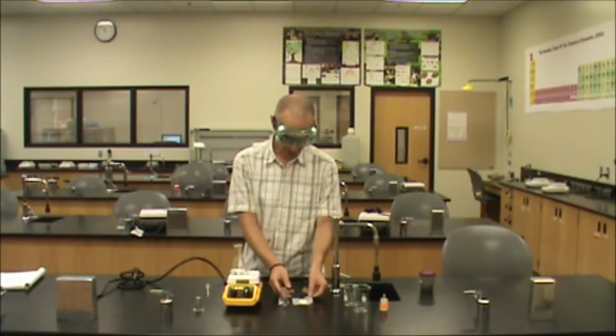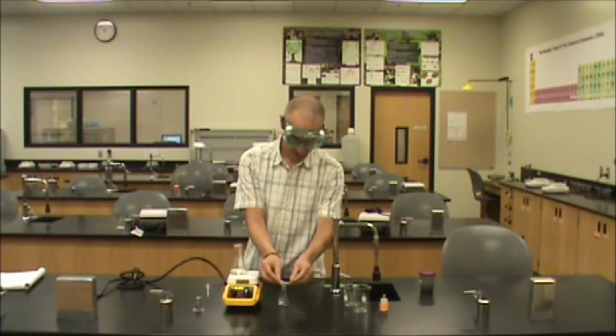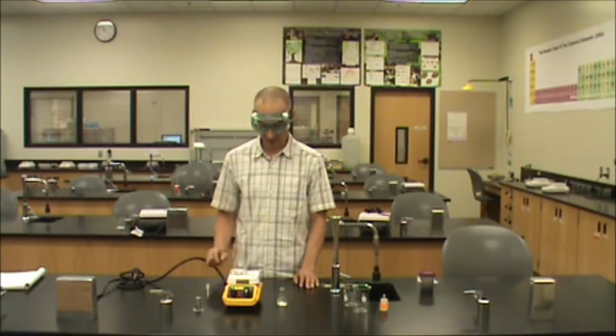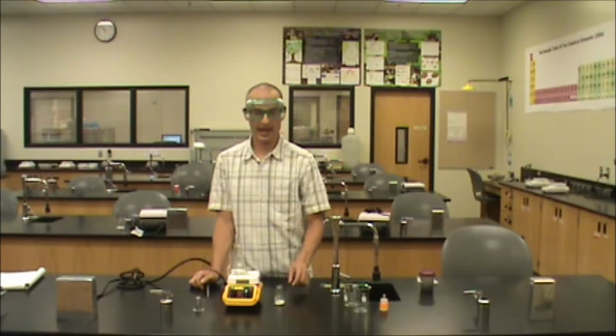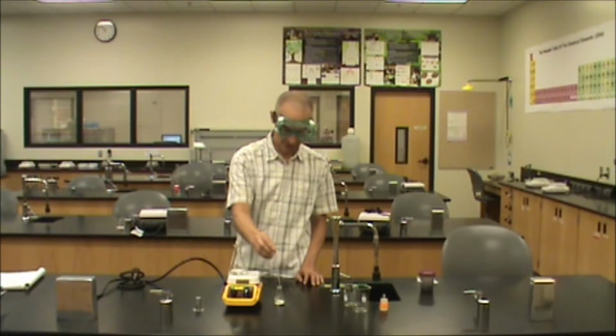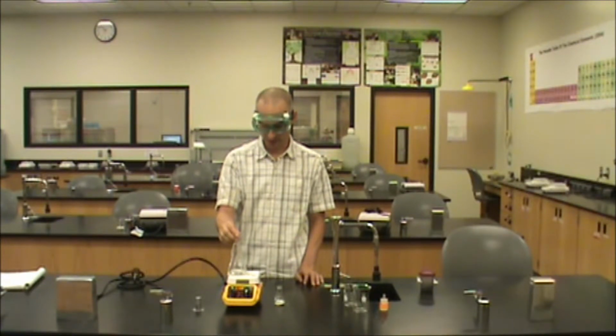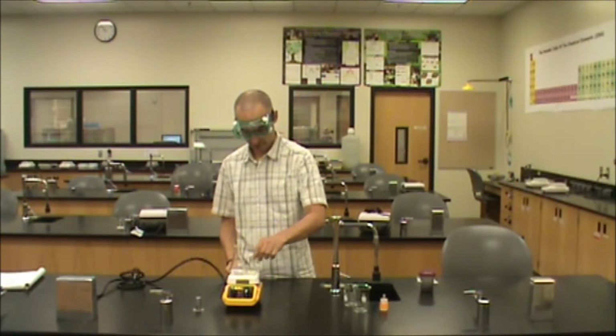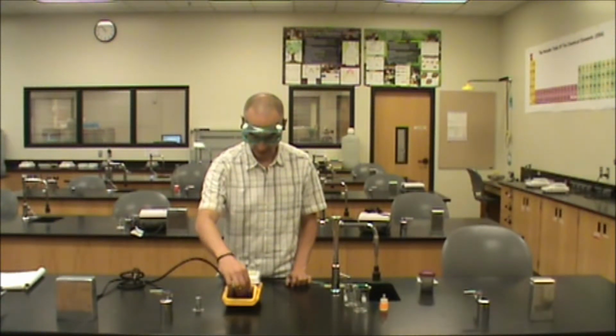I'm going to pour our impure material into a 25 milliliter Erlenmeyer flask. To this flask, I already added a stir bar. The stir bar is going to agitate our solution, as well as provide a surface on which bubbles can form. It's very important that before we add this Erlenmeyer flask to our hot plate, we transfer over some hot solvent. We don't ever want to put this on the hot plate without solvent, because the heat from the hot plate can damage our compound.